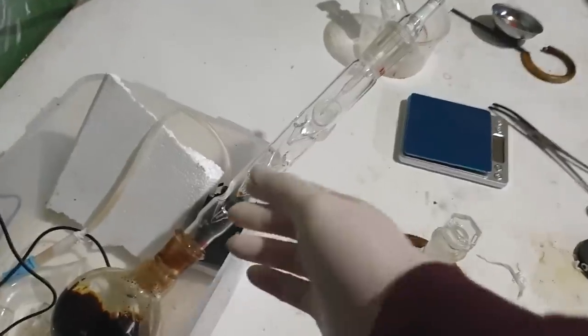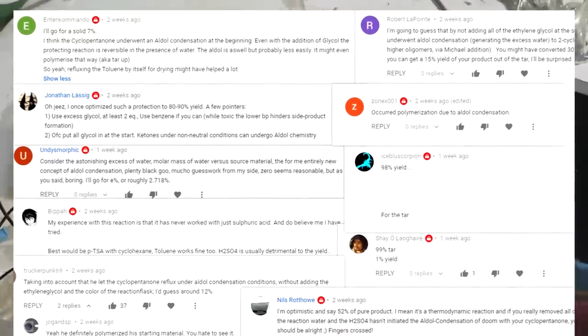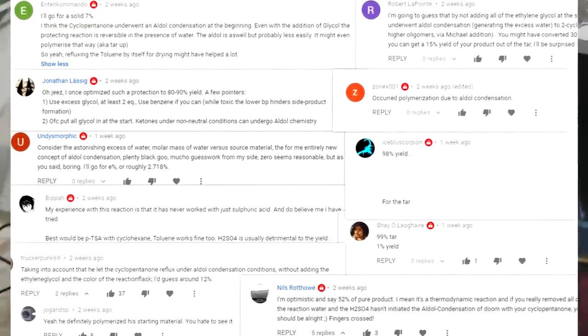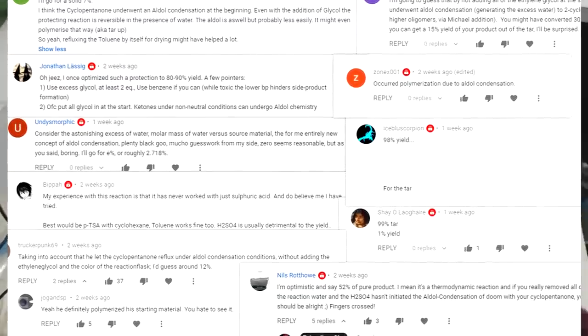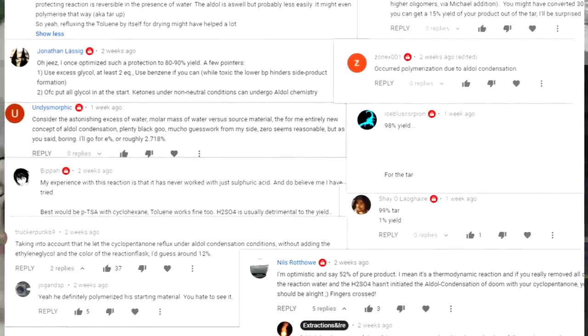So a lot of you suspected this would happen, and that's because I made a mistake in the synthesis. I was overthinking it a little. I didn't want to produce any dioxane, so I held off the ethylene glycol, and I put the sulfuric acid, the toluene, and the cyclopentanone in the flask and heated it up, with minimal ethylene glycol to start with. I think I put a third in near the start.